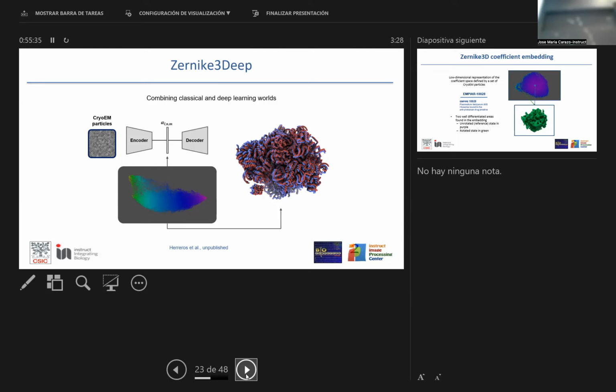I would like to ask the last question. Is there any limitation on the size of the molecule for this kind of flexibility analysis? We have been using it for HER2, and HER2 is probably on the low side. HER2, the extracellular domain part, we are talking about 80K. We would be more comfortable with larger things, but we have used it for that one. So this is a low limit that we have there.